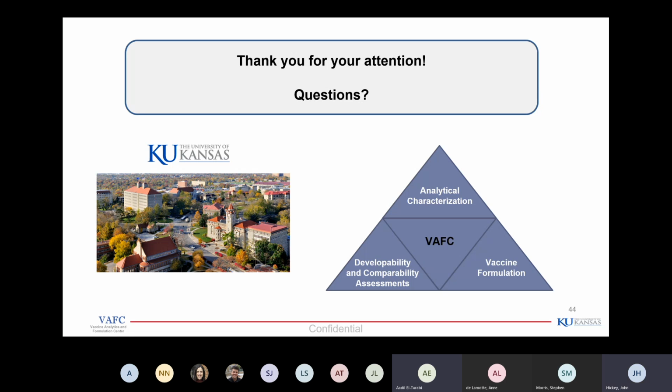Yes, I would say it all comes back to, well, if you have a potency assay, that trumps everything else, because if you have, let's say, all these modifications or truncations, but it has absolutely no effect on the potency, then really, how much do you need to worry about it?